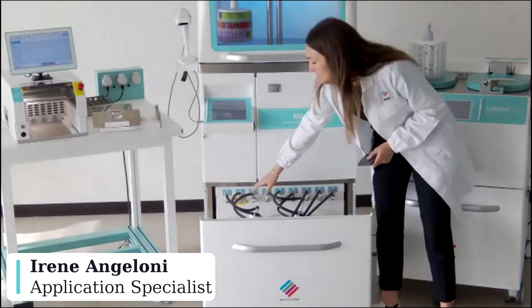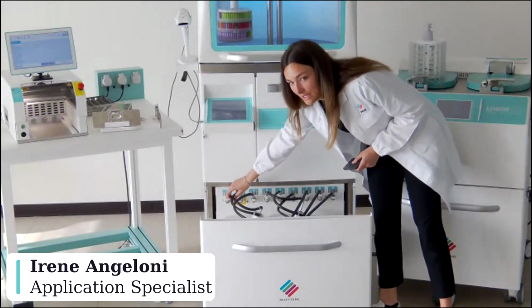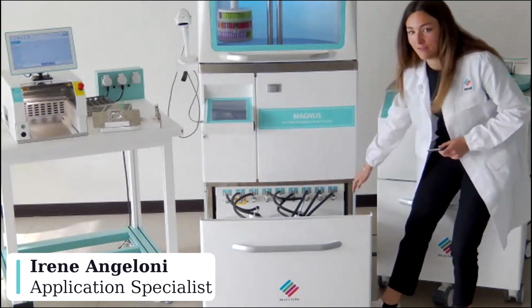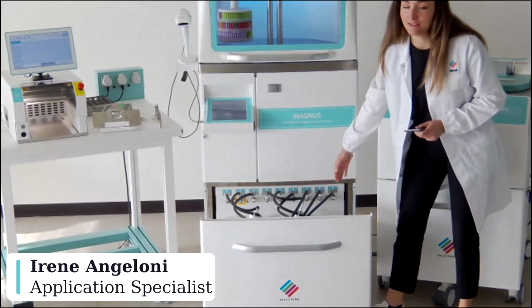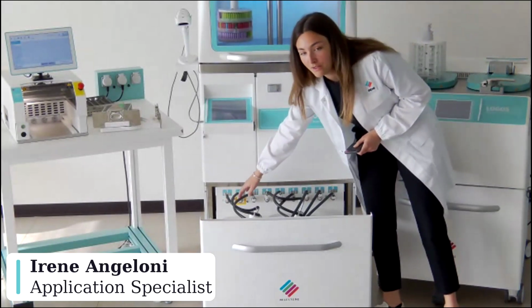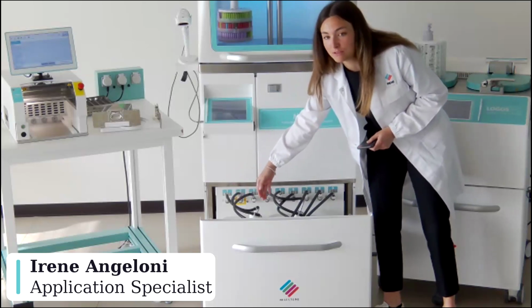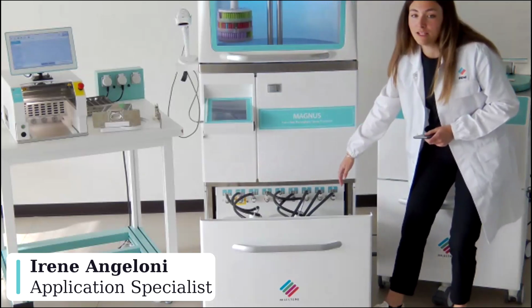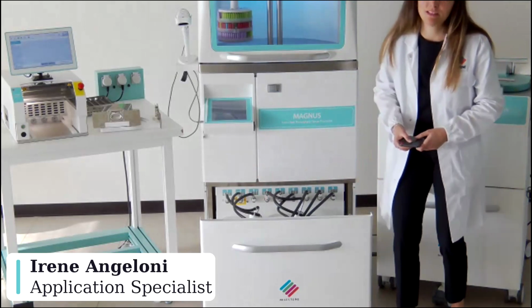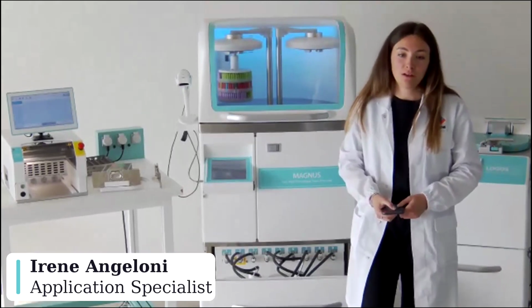The first two positions for the first two tanks here have a different circuit from all the others, so that we avoid the contamination between the first two reagents that are water-based, formalin and alcohol 70, and all the others that are instead alcohol-based reagents. Alcohol-based reagents meaning ethanol, isopropanol, and so on.